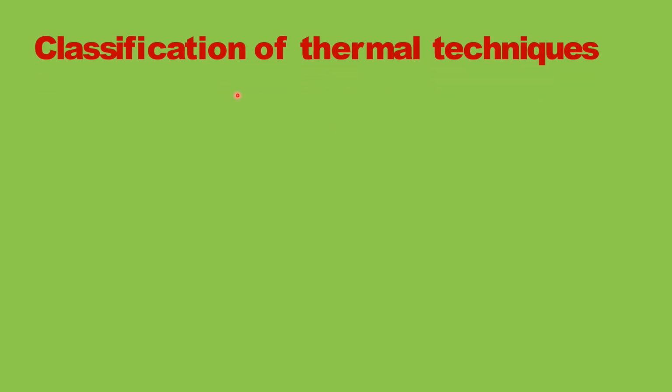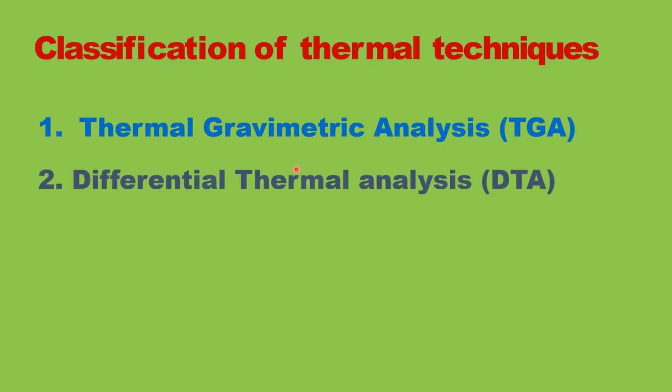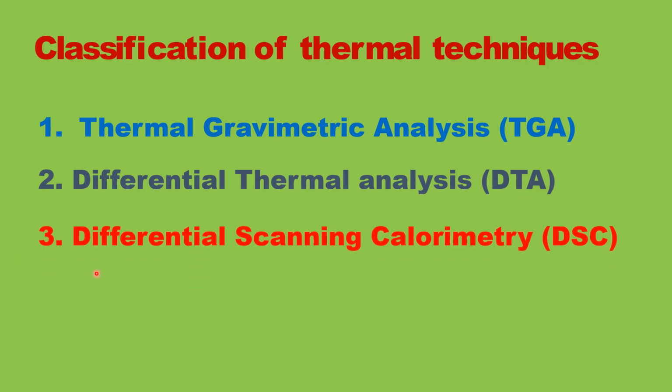Let us see the classification of thermal techniques. There are three types of thermal techniques. They are thermogravimetric analysis, TGA, differential thermal analysis, DTA, and differential scanning calorimetry, DSC.